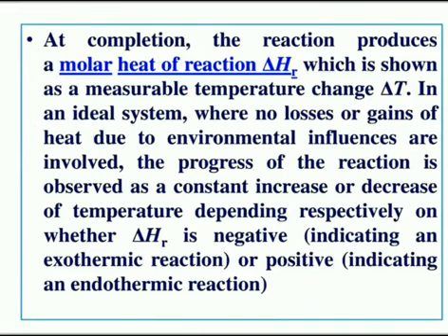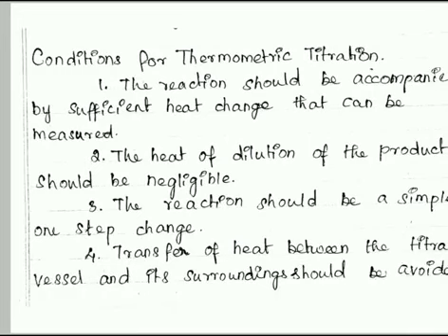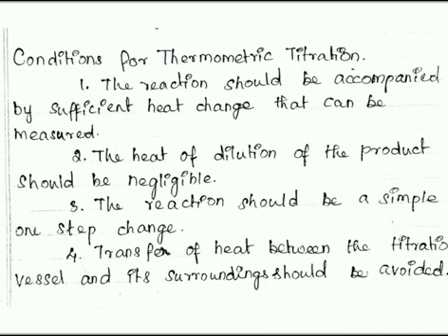So now we know what is thermometric titration. Now we shall see some of the conditions for thermometric titration. If we want to conduct the thermometric titration, we need to follow certain conditions. There are four conditions here given.